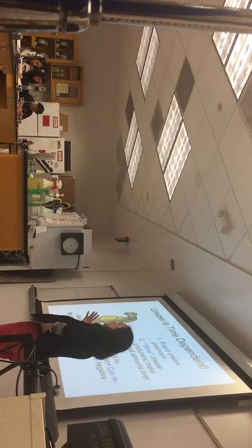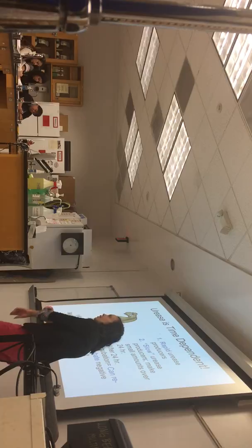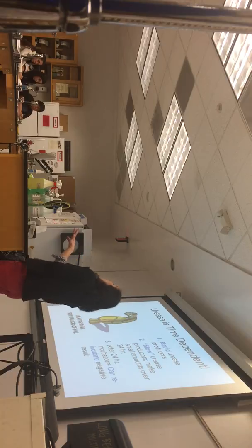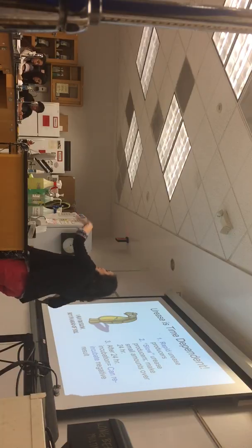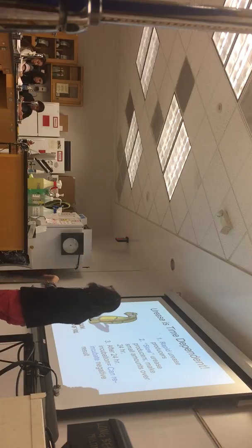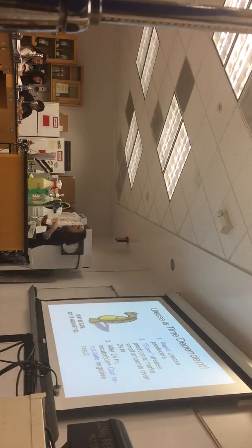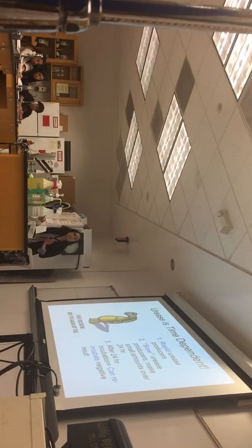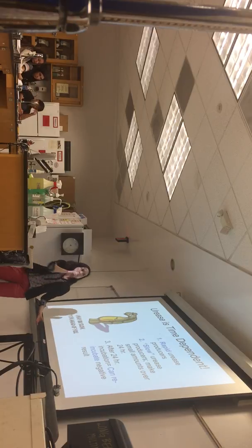Some of you though might get kind of a middle where it's starting to change, and it looks like there's some ammonia that's starting to show up. If that happens to you, just don't throw it away right away. You can just put it back in the incubator for an extra day or two, just to give it enough time for the color to develop, so you can be more confident about your results. So if that happens to you, you end up in that slow category. It doesn't look negative, but it doesn't look like an obvious positive. You can always re-incubate just for a little bit longer.